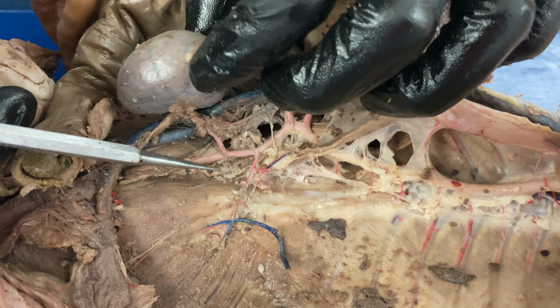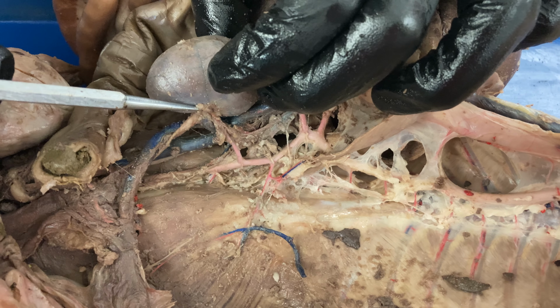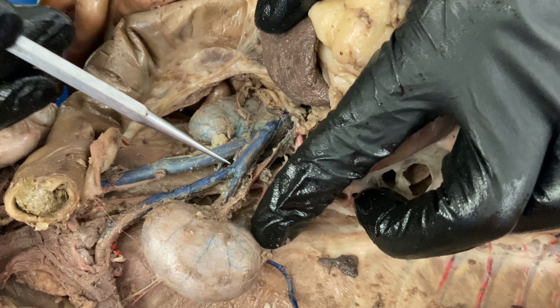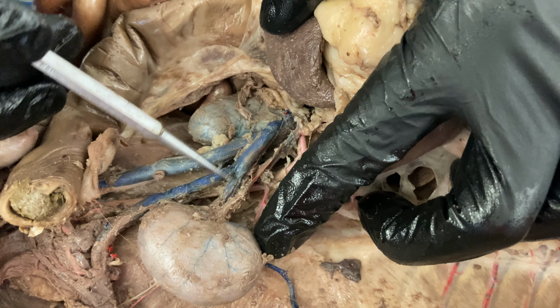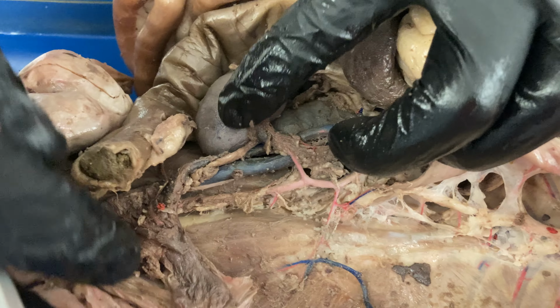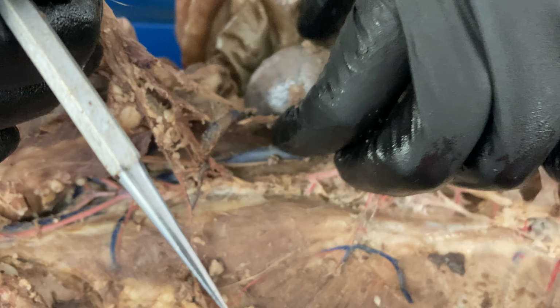As we continue down, the next branch that we're going to see is going to be your renal artery. Again, this would be your left kidney. So this would be your left renal artery coming to the kidney. Now, it's much smaller, and you can see the renal vein. So we'll get back to the veins in a minute. Okay. As we continue down, the next blood vessel that we want to look for is the gonadal artery.